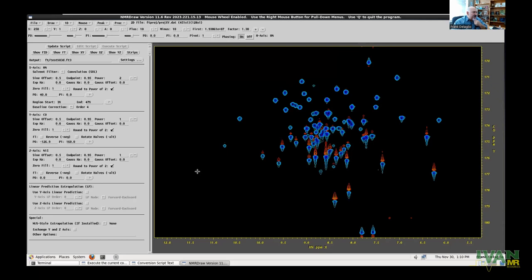It's generated by a series of pulses and delays, and you have to set up the timing. But fundamentally, we are assuming a linear error, right? I mean, that's pretty much what we are doing after the FT. We are assuming a linear error across the spectrum, and first order may be zero, but in the direct dimension, we are assuming linear, and it does a pretty good job. In the indirect, we are still assuming linear, so why do we need to have 180 or a 90 or a zero to do it right? I still can't understand that.